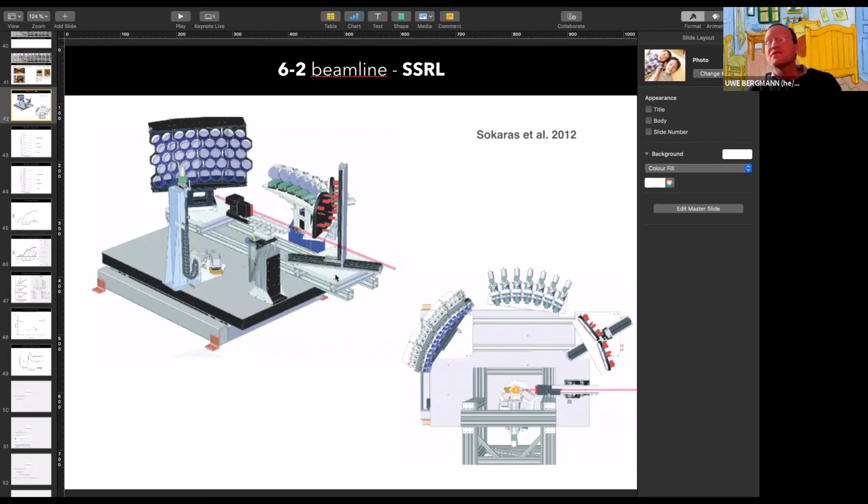If you go to X-ray Raman imaging, which is the specialty of Christoph Sahle and other instruments, at that point the brightness of the synchrotrons will really help you. And of course, you can also use the instrument that Christoph has been building in both modes.